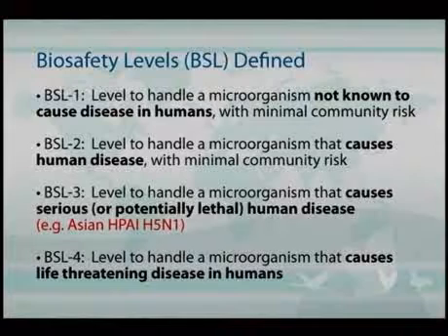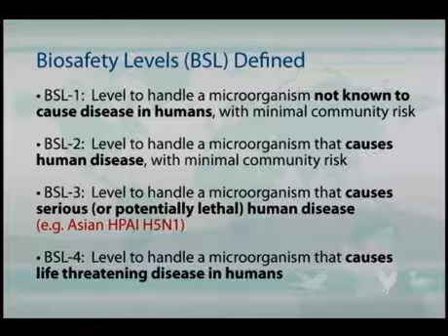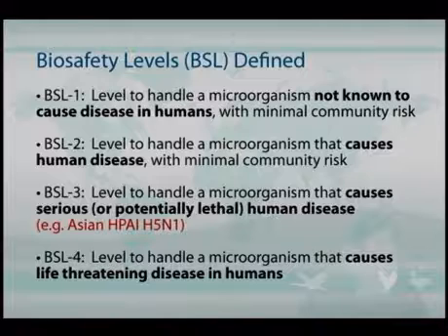In this manual, they have divided biosafety levels into 4 categories. The BSL-1, which is the lowest level of biocontainment, are really an environment to handle safely microorganisms that are not known to cause disease in humans, and of course because of that have a very low community risk.